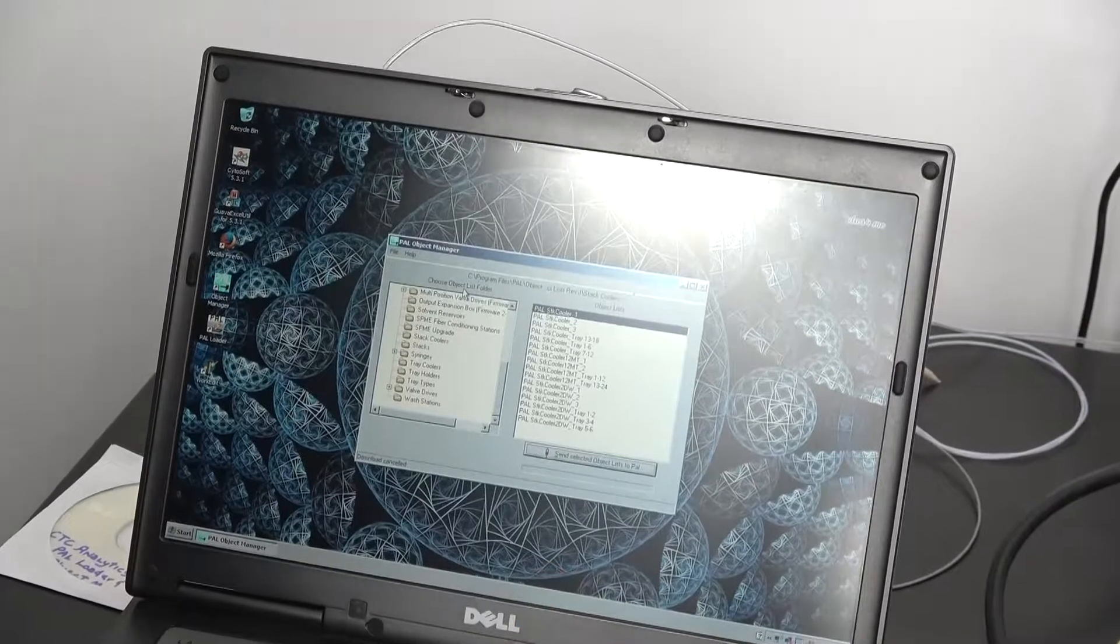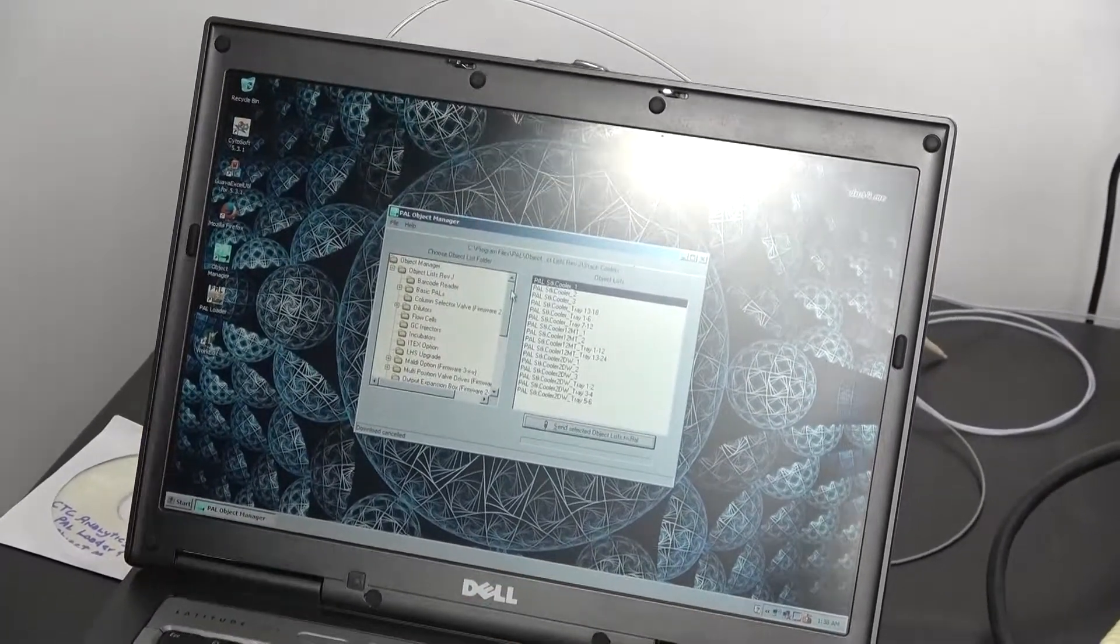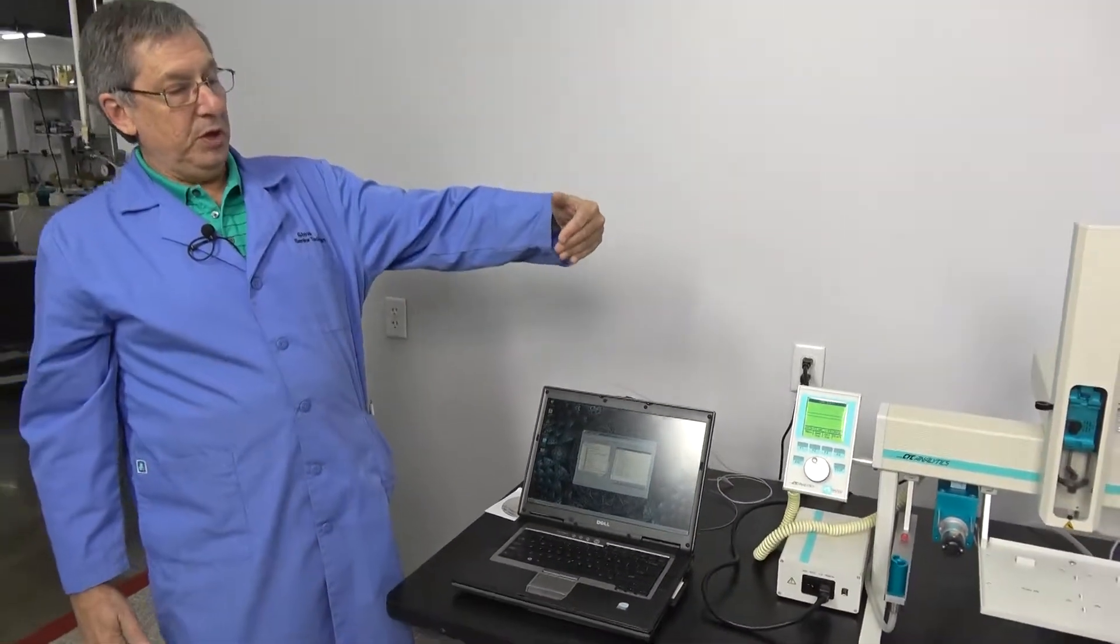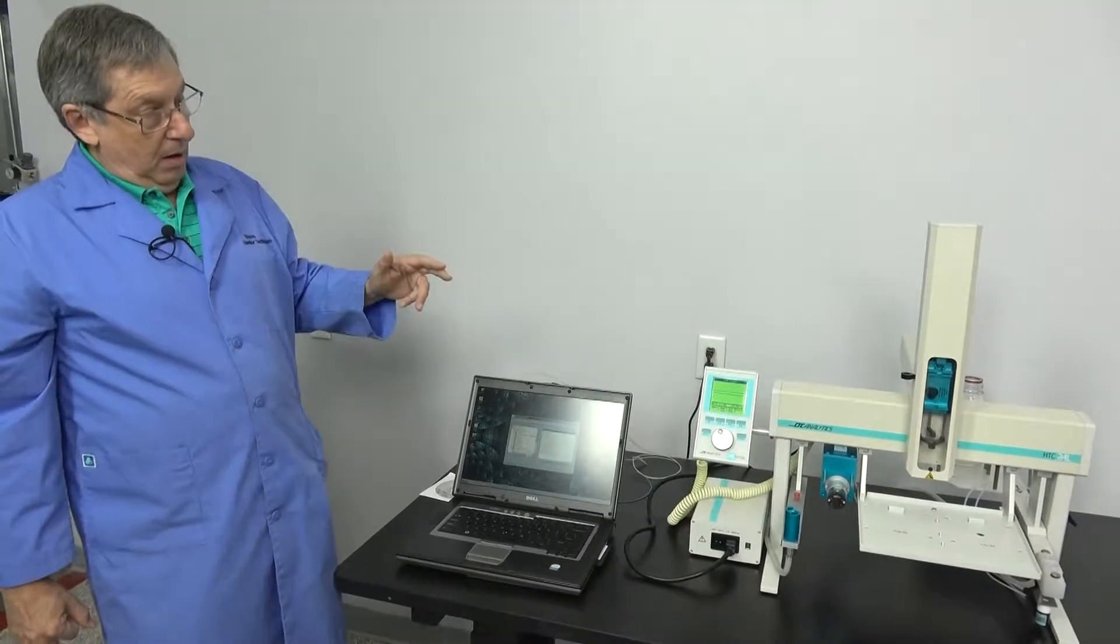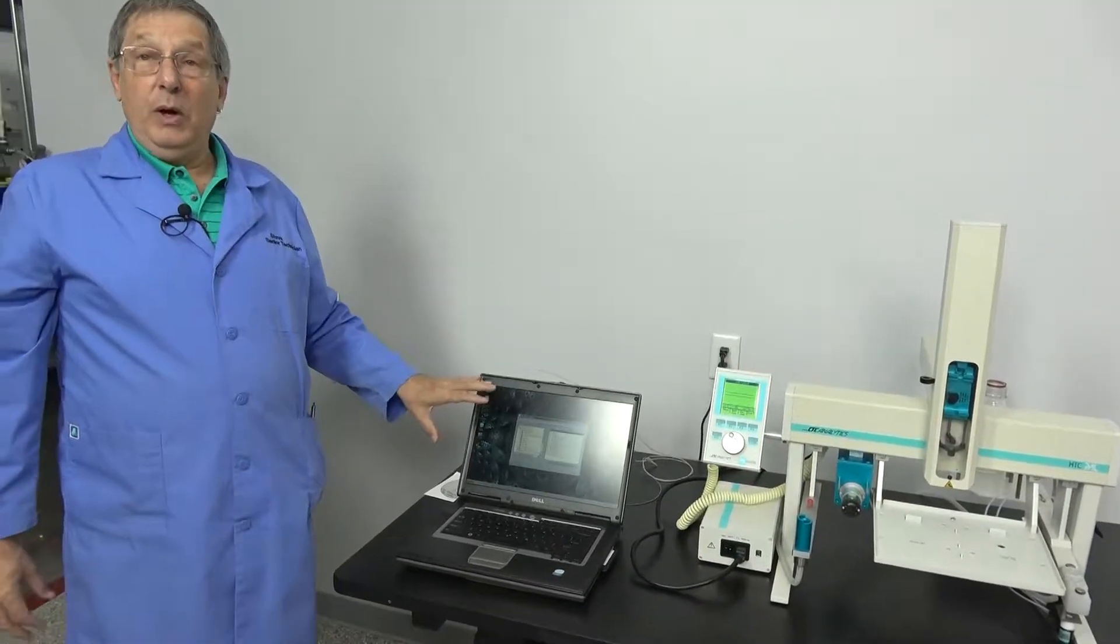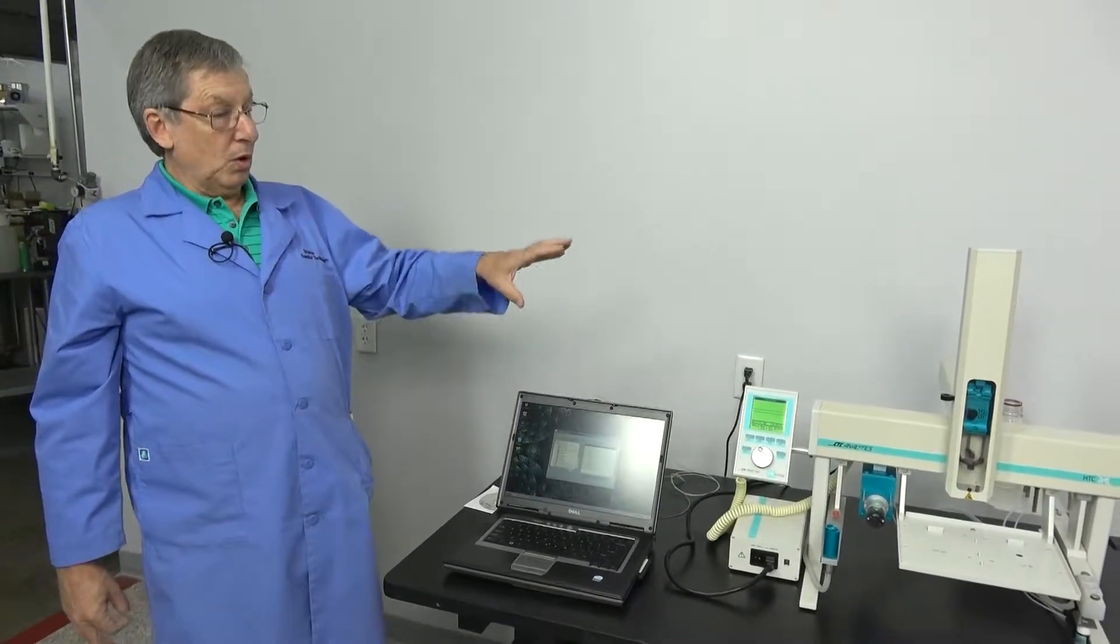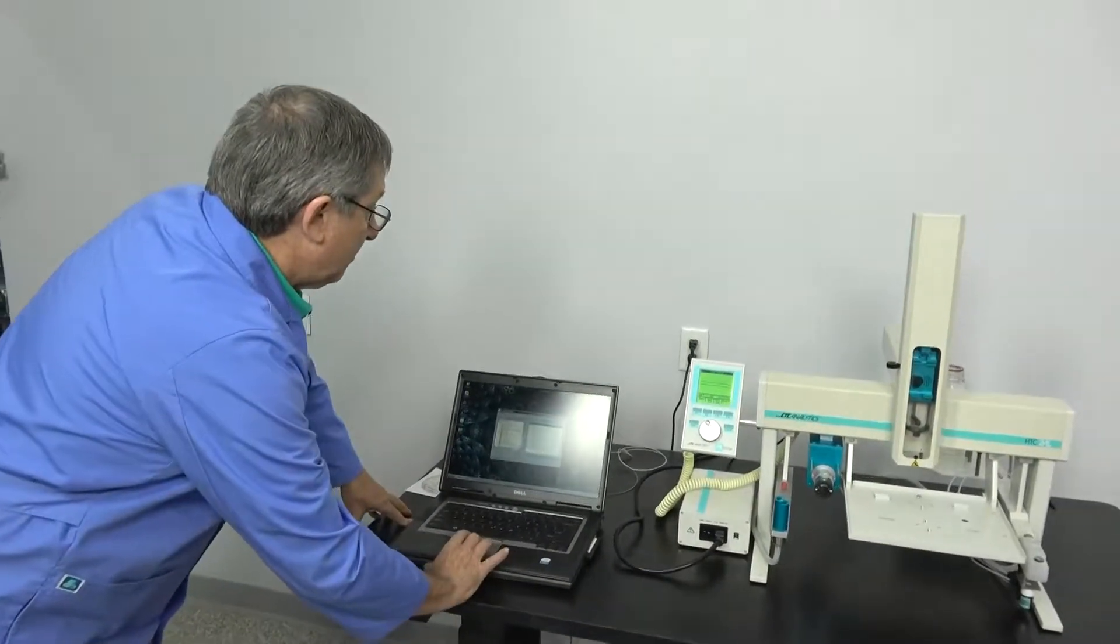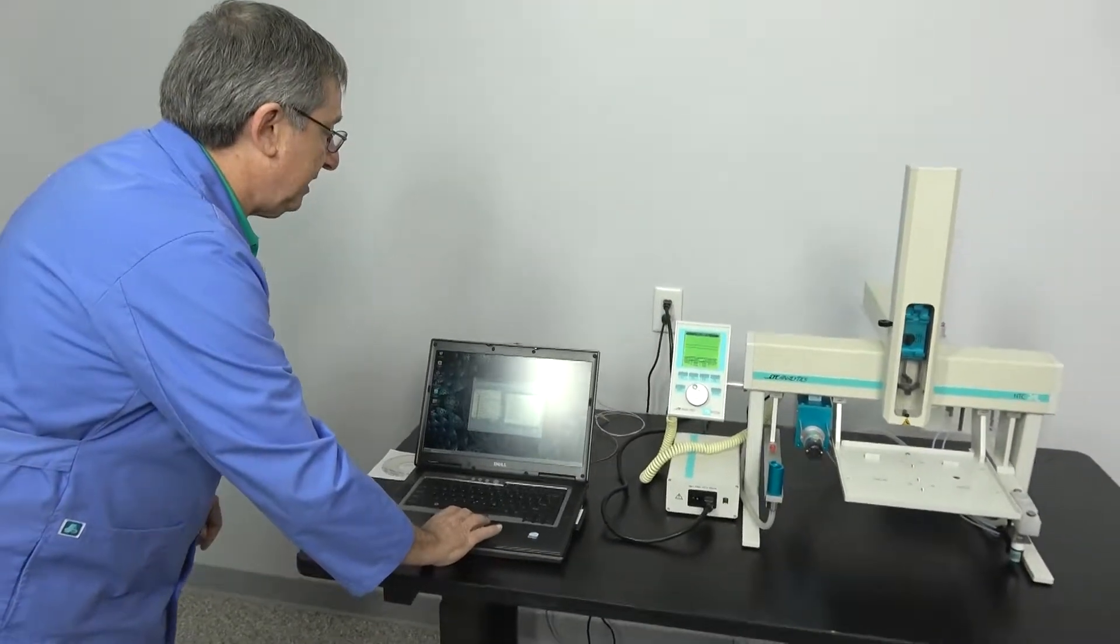Evidently it's not finding the tray cooler out there, which we don't have hooked up. So if you do get a unit from somebody other than us, we do configure the units with all the objects involved. That is how you're going to do it. Or if you want to add one of our systems, you're going to add a cooler, a different tray, a different rack. That's why you're going to want those CDs.